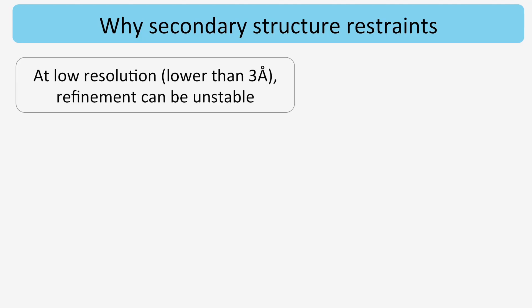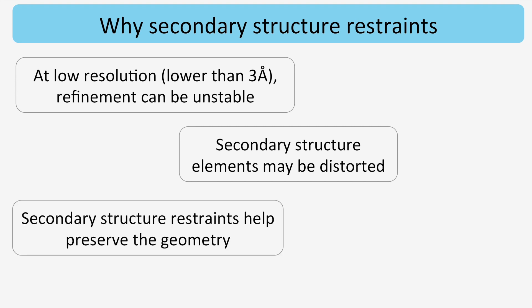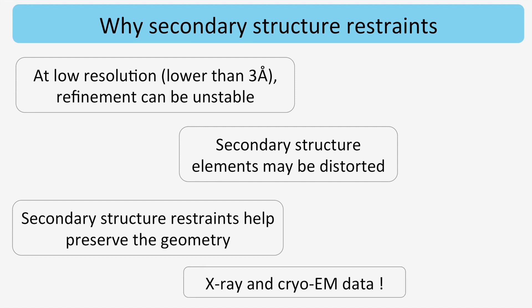At resolutions lower than about 3 angstrom, refinement of coordinates may be unstable. In particular, secondary structure elements may be distorted. However, using specifically designed secondary structure restraints may help preserving their geometry, and slightly distorted elements might be corrected. Note that this applies to refinement against X-ray or cryo-EM data.